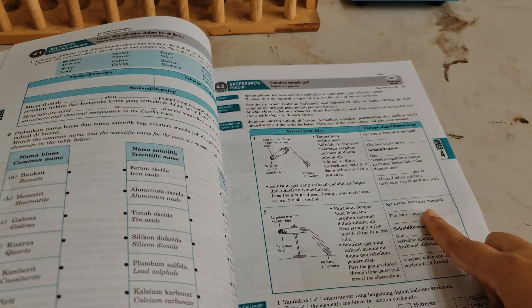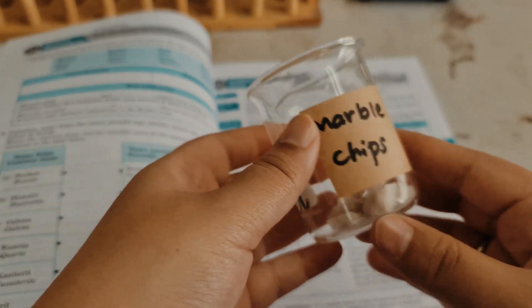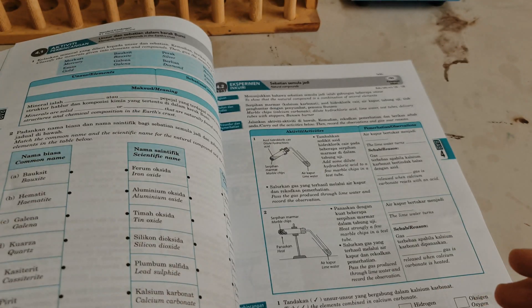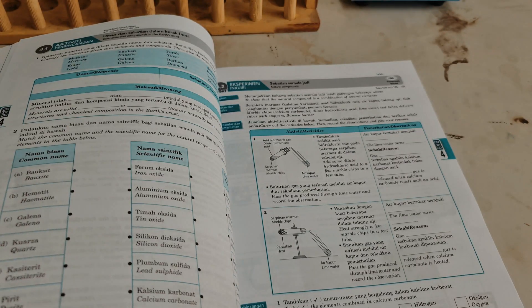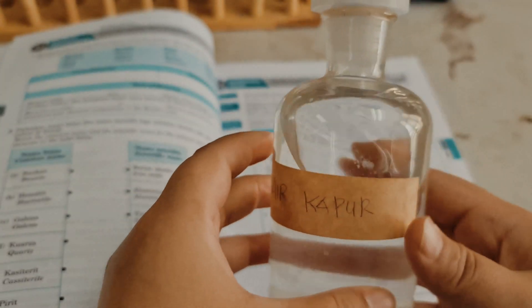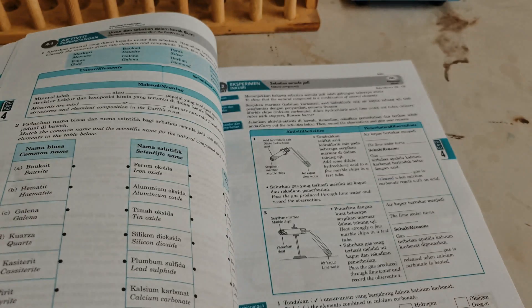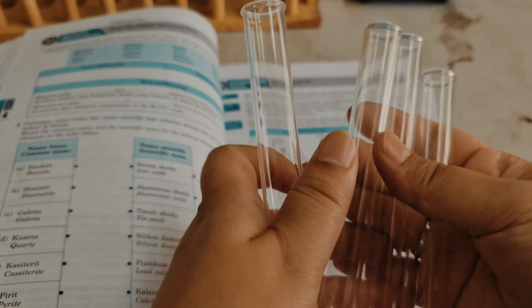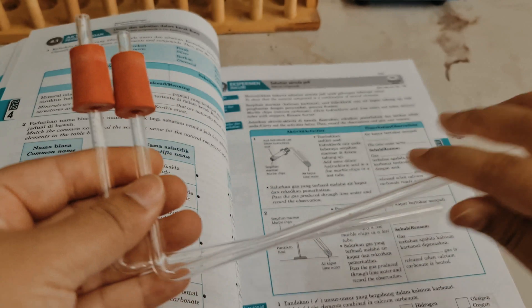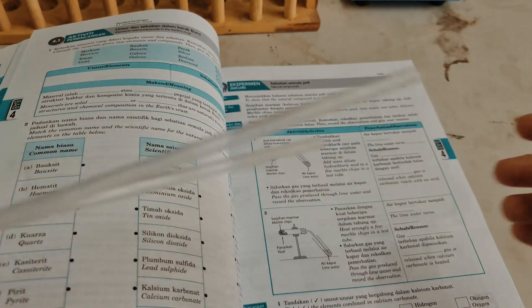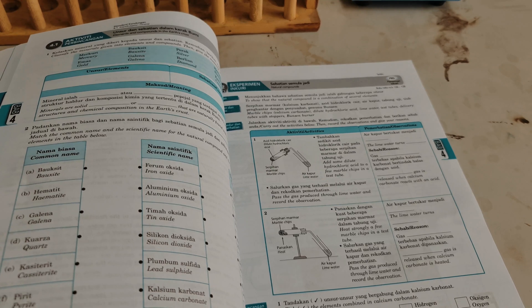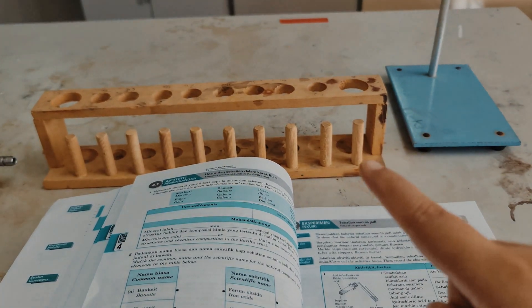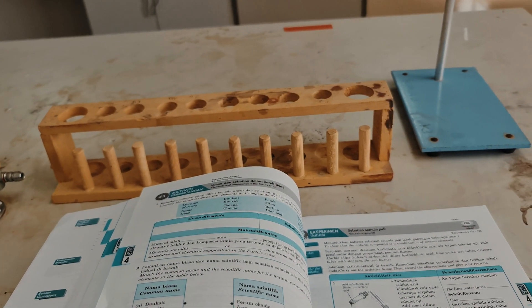So in this experiment, we need some marble chips, which is actually calcium carbonate, and diluted hydrochloric acid, limewater, test tubes, delivery tubes with stopper, and Bunsen burner. We're also going to need a retort stand here and some rack for the test tubes.